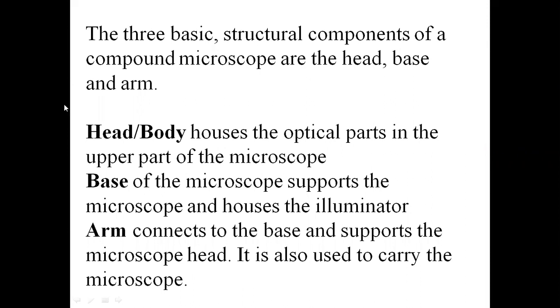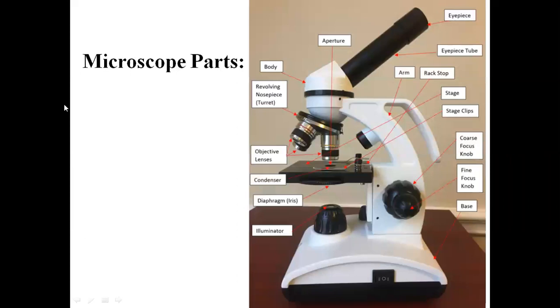Then we'll discuss the different parts of the microscope. You might have seen the microscope in your college and schools. Among the different parts of the microscope, we can see that this portion is your eyepiece. In the microscope, the optical part generally consists of this portion up to this area only.